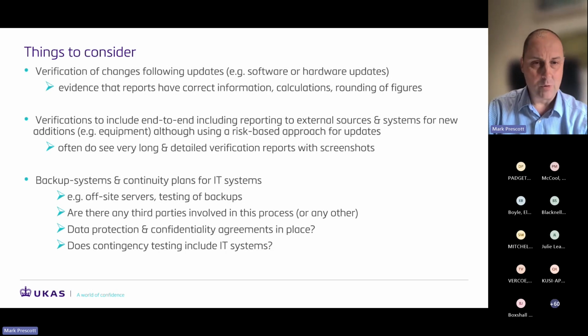Again, I've seen some examples where this is done very well. It's also important to test your backup. It's all very well backing up your data every few hours or every day, but have you done any audits to check that you can actually restore that data? If your system goes down, yes, you've got the backups, but can you recover them and do they work? We have seen instances in the past where backups have been done, but when somebody gets the backup tapes out and tries to restore the data, it's corrupted or not working.